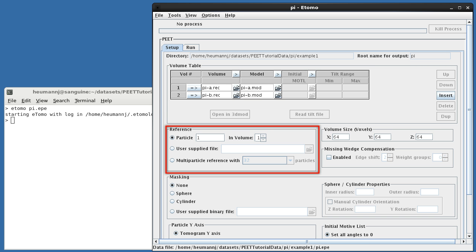We also need to select an initial reference against which the remaining particles will be aligned during the first iteration. You can specify one of the sample particles as we've done here, a user-supplied reference or a multiparticle reference. Notice that in PEAT, the terms particle and sub-volume are used interchangeably.